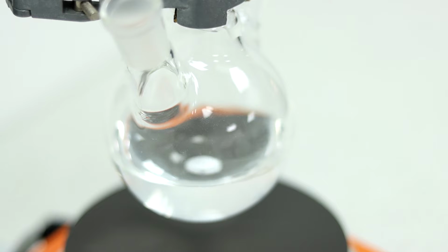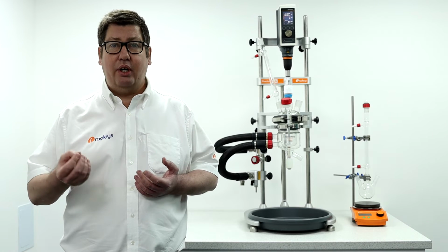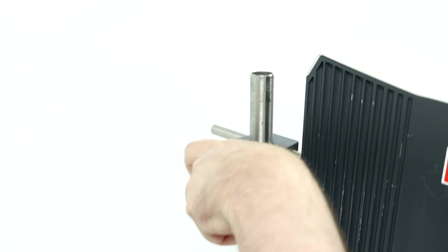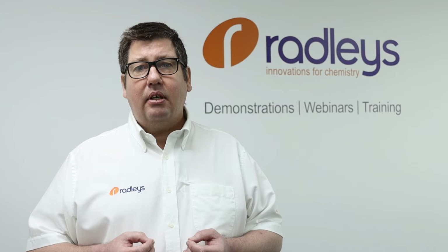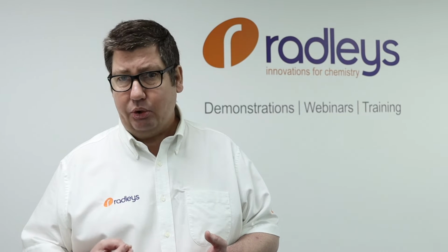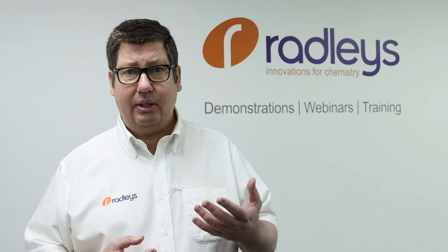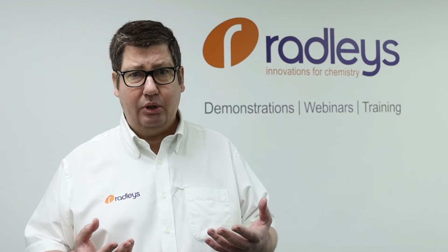We often find the chemist might prefer to use magnetic stirring with stirrer bars on a scale of 50 ml, 100 ml, 250 ml for example, as opposed to overhead stirring where traditional systems may be more difficult to set up. Overhead stirring systems are sometimes not considered when working on this small scale. That could be because of the difficulty in setting the apparatus up, mounting an overhead stirrer onto a framework in the back of the fume hood.